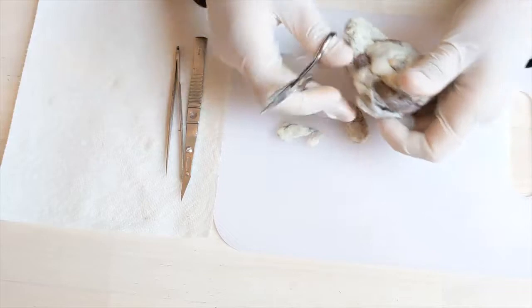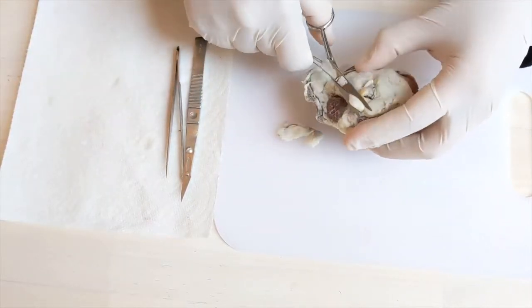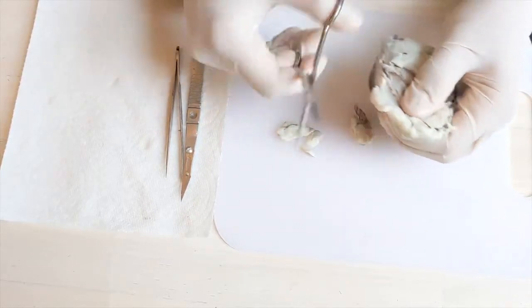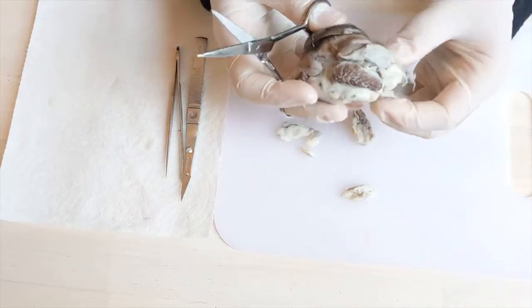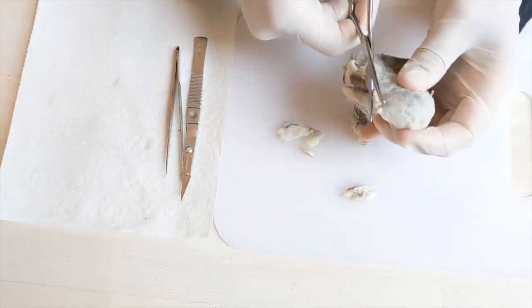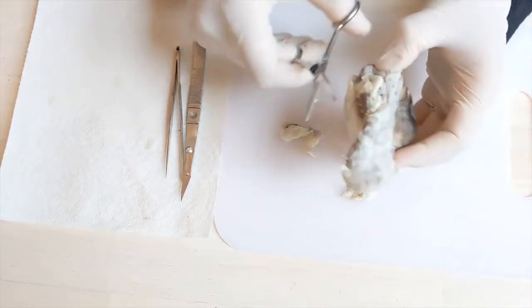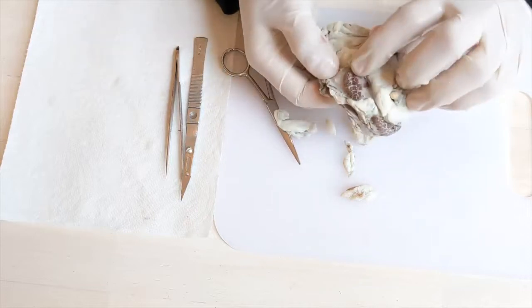So do we want the eye to be just wandering around in this hard skull without something to cushion it? No, right? So this white stuff here, or the fat, acts like a cushioning agent for the eye and protects it from getting hurt from the hard bones in the skull, which are very sharp. Exactly.